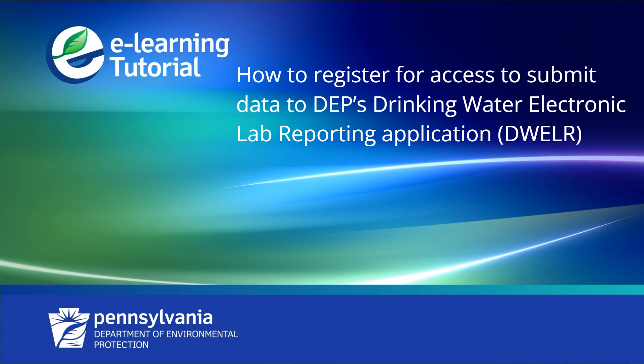Welcome to this short video showing you how to register for access to submit data to the Pennsylvania Department of Environmental Protection's Drinking Water Electronic Lab Reporting Application, or DWELR for short.